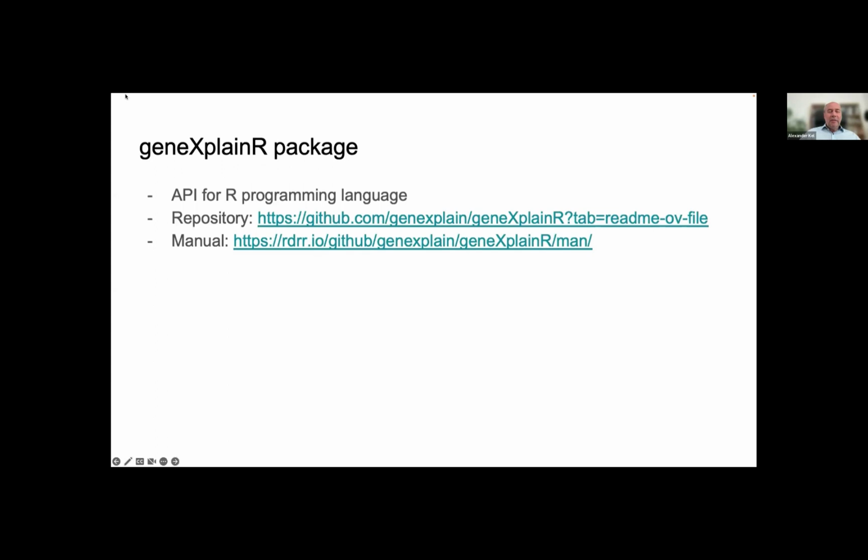So is it only R, or are there other languages? You mentioned Java, right? So Java and R, that's what we have.